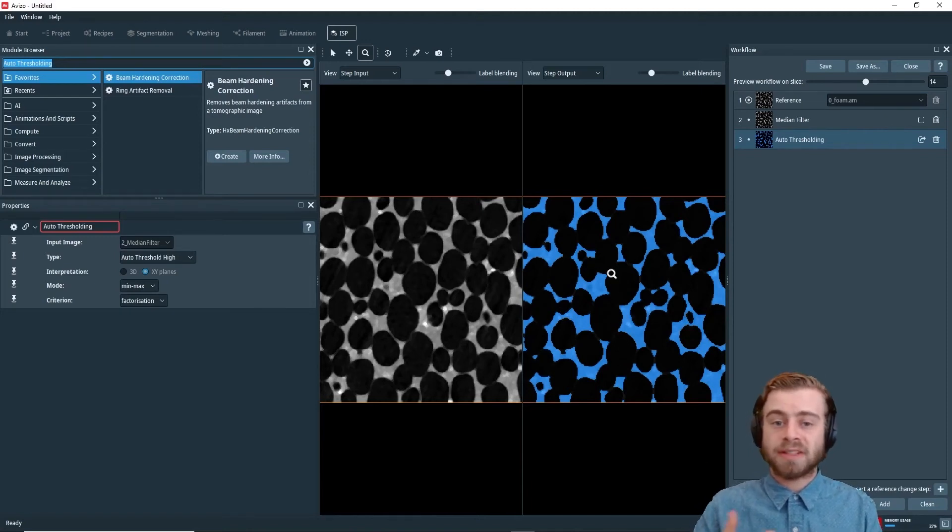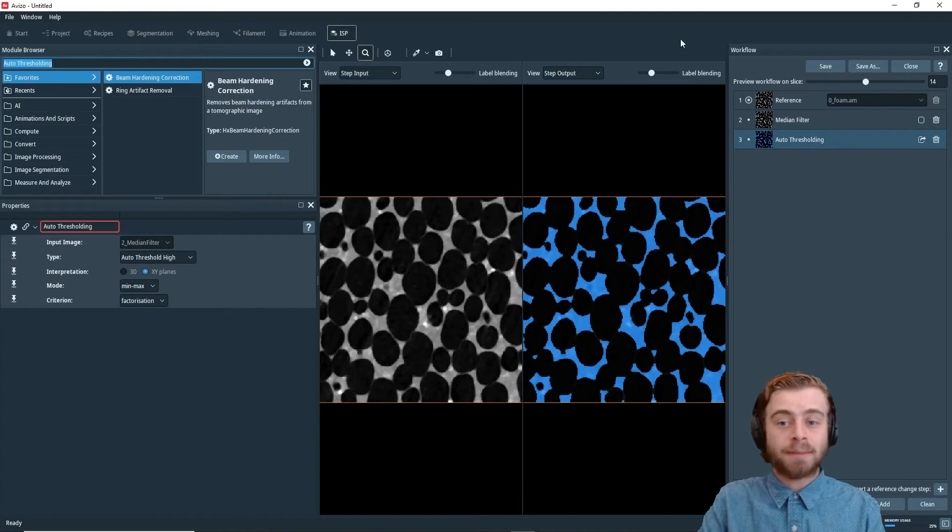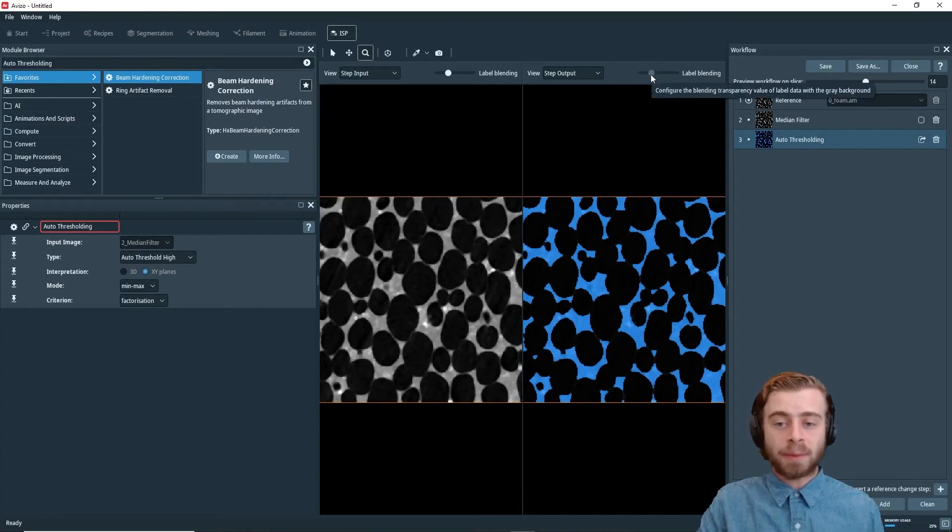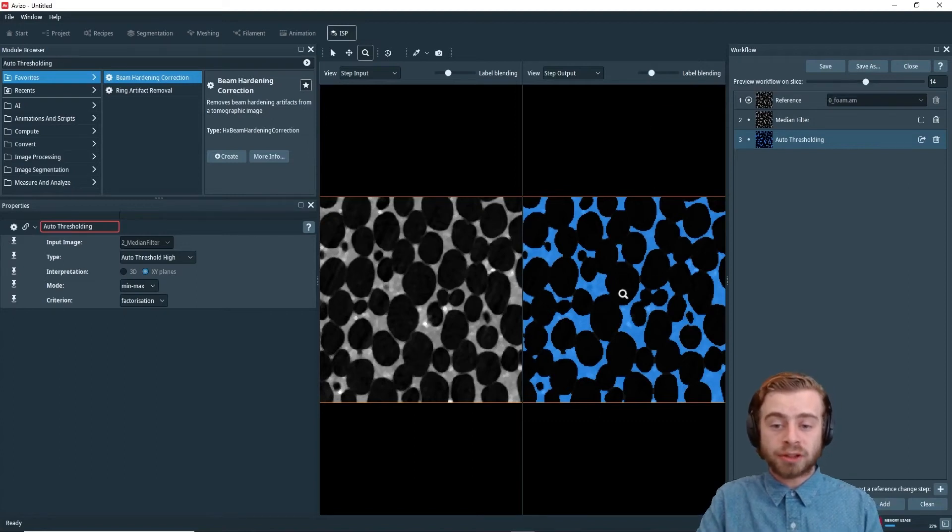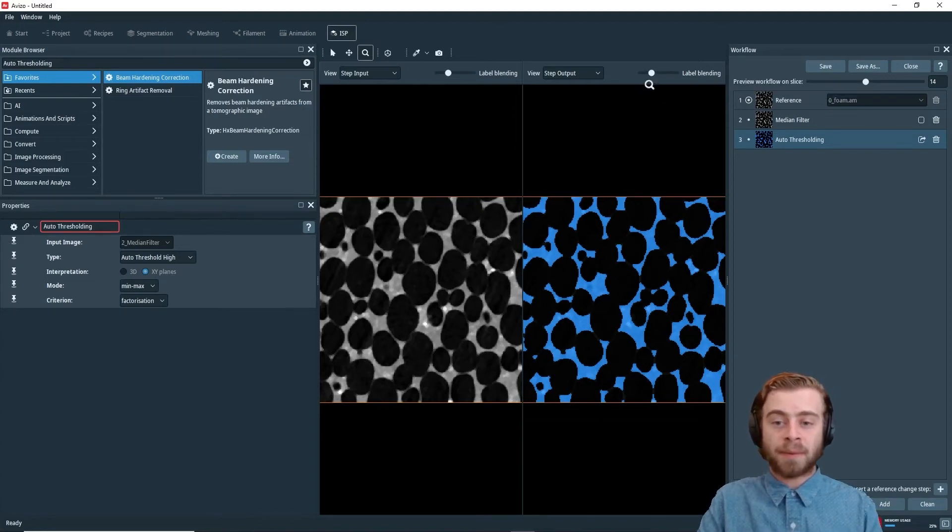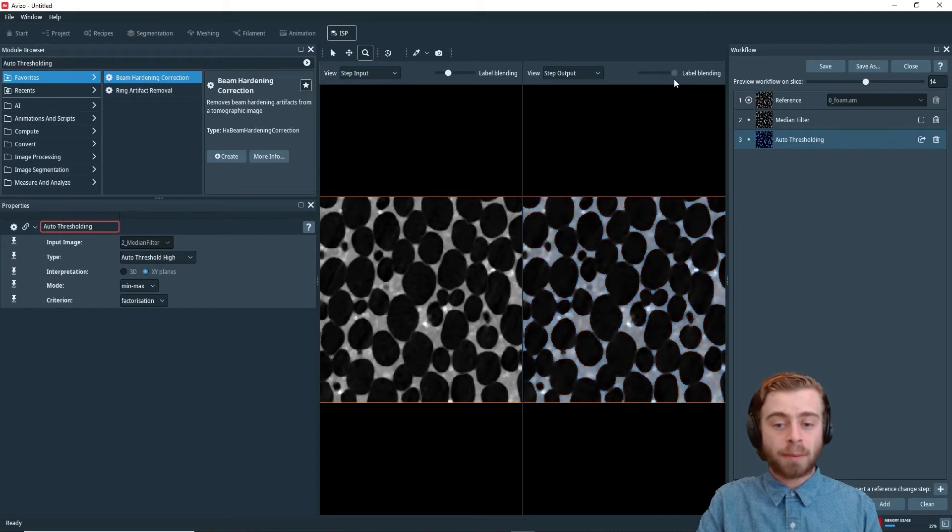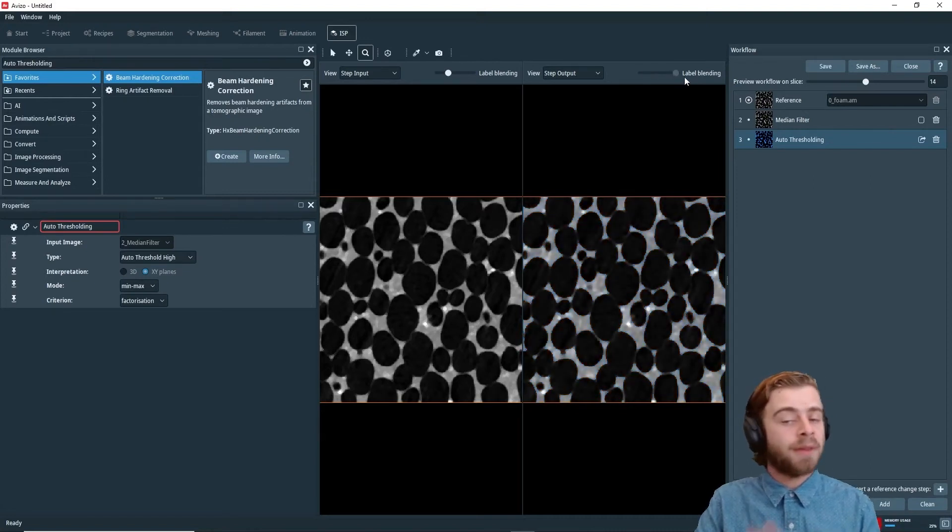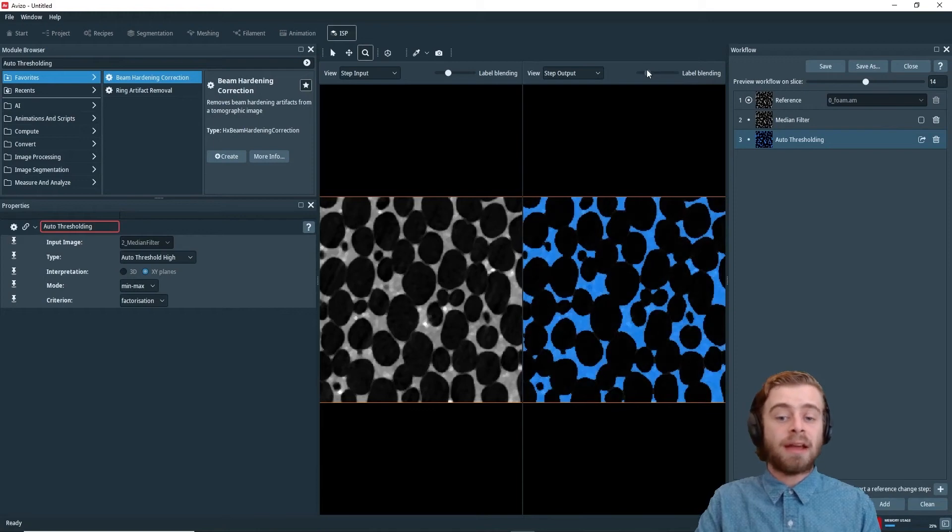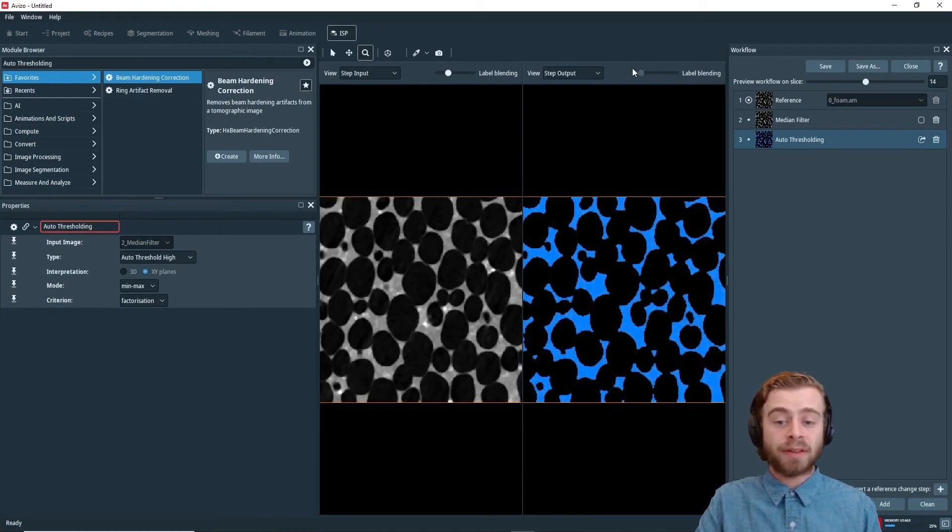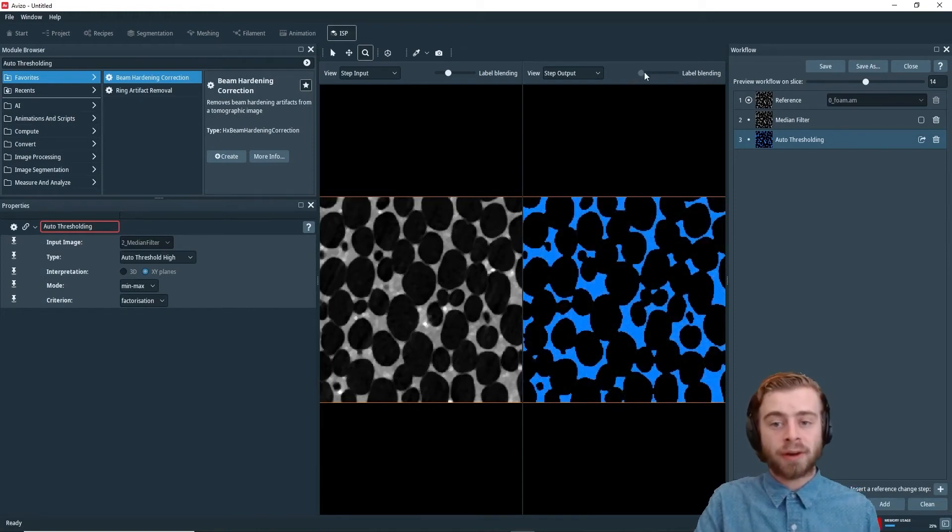Next, I want to go over this label blending part right here. This label blending slider allows you to overlay this auto thresholding output with the grayscale output. So if I move this more towards the right, it just shows the grayscale output. And if we move it more to the left, it just shows the auto thresholding output.